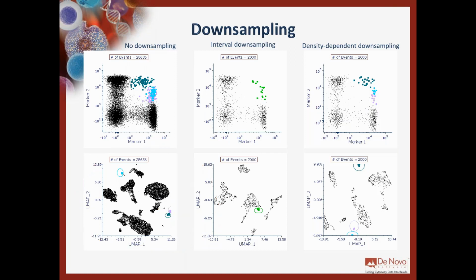And after a few backgating steps, I found out that these two populations are actually three. You see one island here, one island here, one island here. The reason is that what I thought to be a single population actually contains cells that are negative and positive for another marker. We can call it marker 3. So I was surprised, and I found out that I actually have 3 populations in that region.